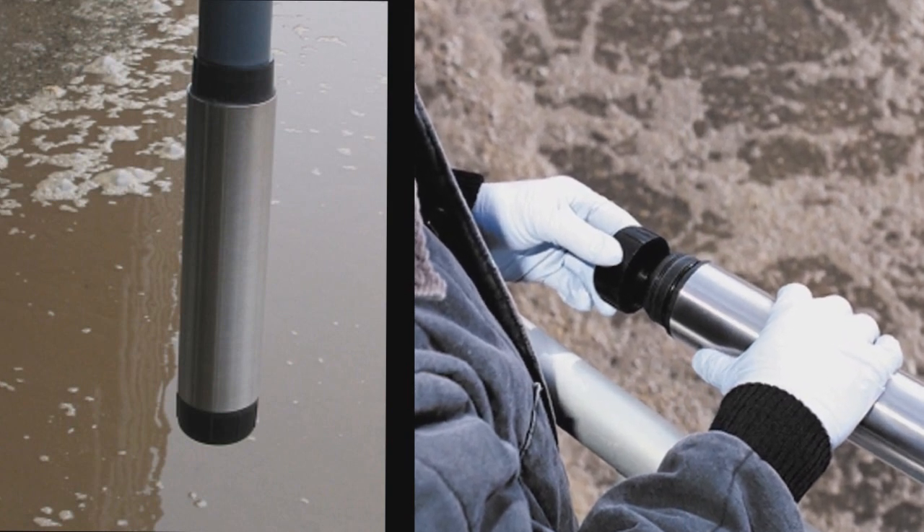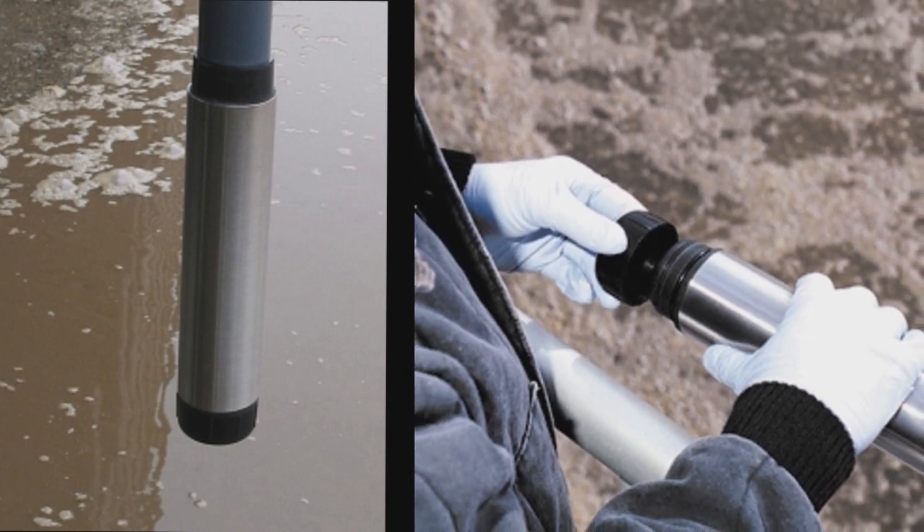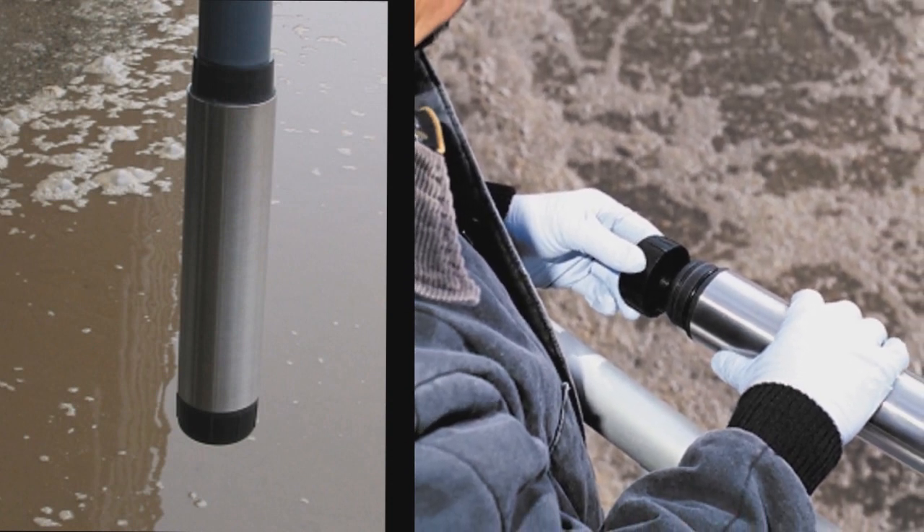If you have any doubt about this procedure or feel your cap has failed prematurely, contact Hach Lange and we will support you in every way we can.